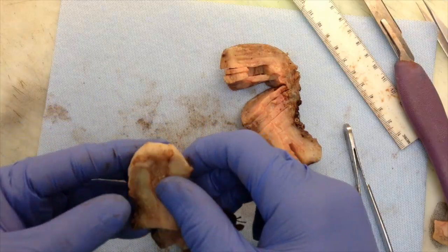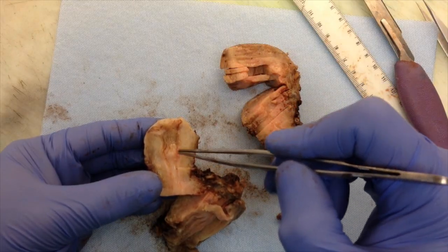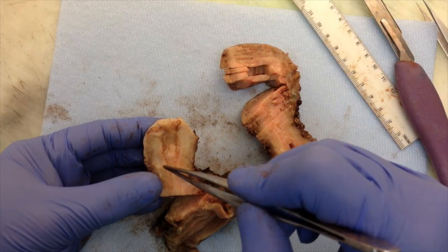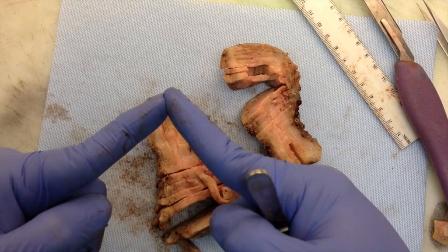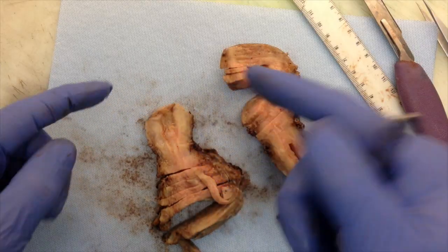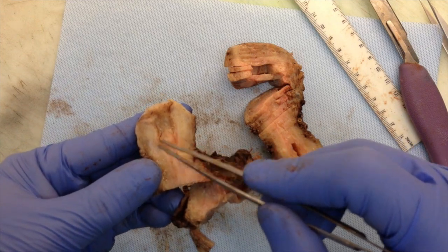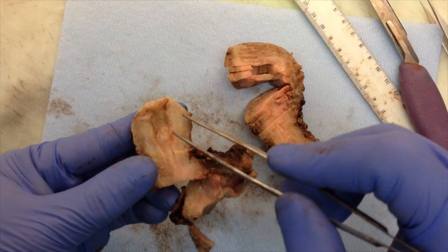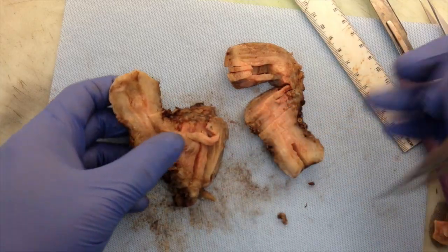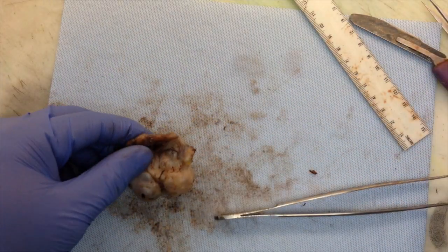The only other thing is, so I did comment that the endocervical canal is chevron shaped, and it's kind of difficult to appreciate in this particular specimen, but normal architecture is like chevron, like the chevron sign from the gas station, kind of like V's. So it's difficult to appreciate on this, but some people say they call it herringbone, and some people call it a chevron, so that's what I say. So first we're going to separate the fallopian tube from the ovary.